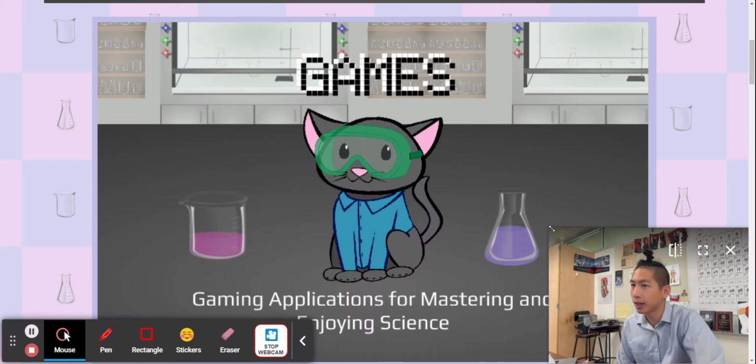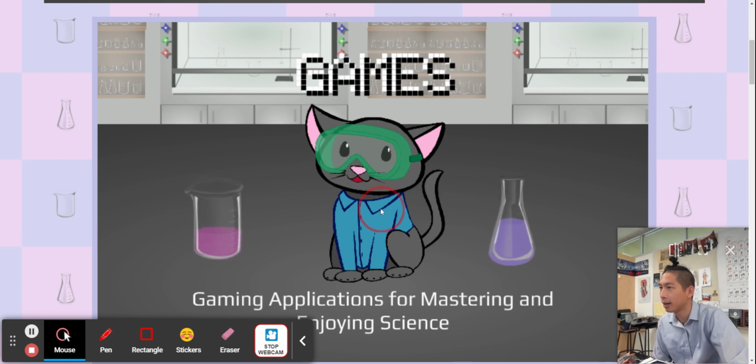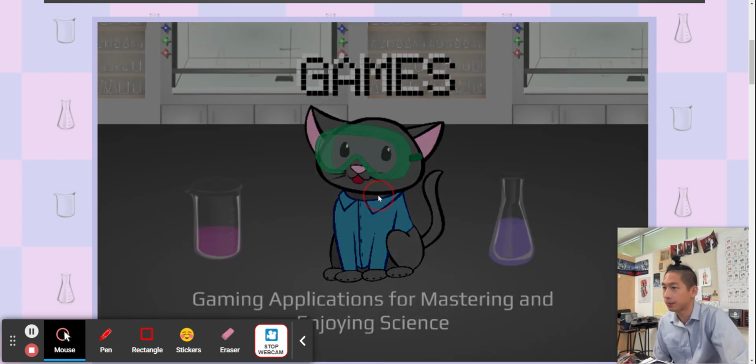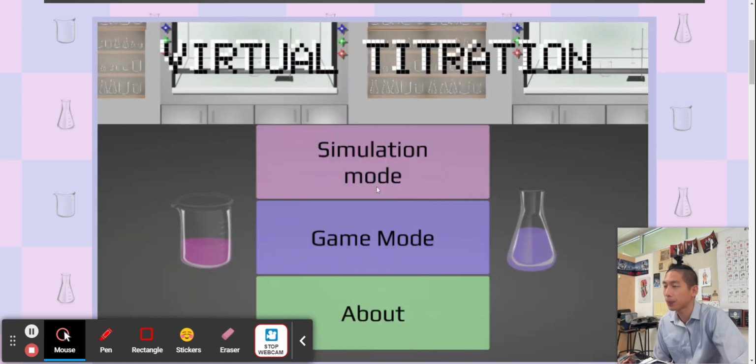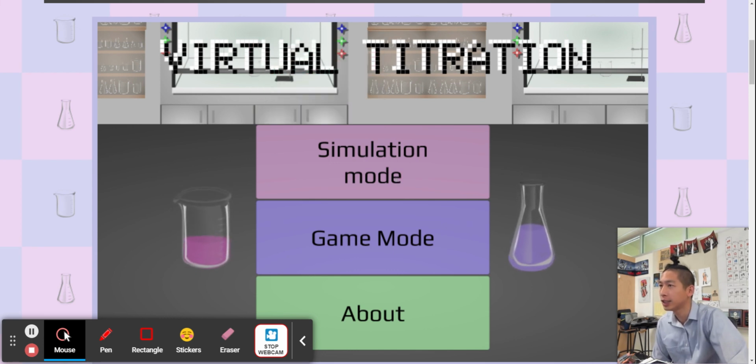Everyone, today we're going to be doing a lab with this guy. Okay, let's jump right into it. We're going to do a virtual titration here.